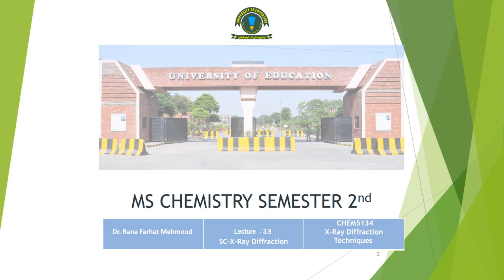Dear student, Assalamu alaikum. We are back with our ninth lecture about single crystal X-ray diffraction, in which we have studied different techniques using different kinds of sources like X-rays, neutron, electron, and this is the third technique that we are studying in this lecture. This is Scanning Electron Microscopy, SEM.